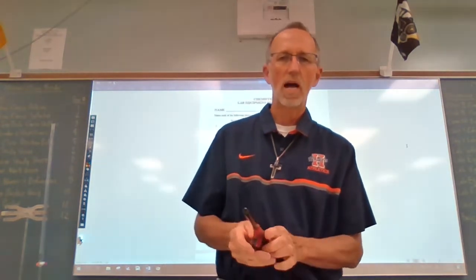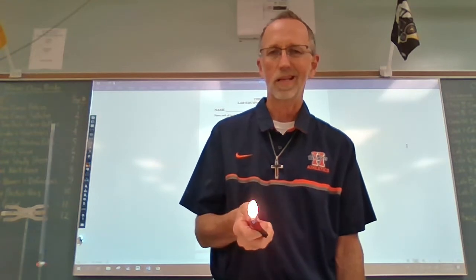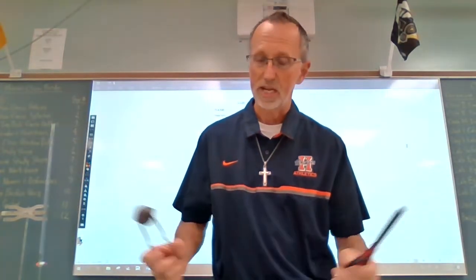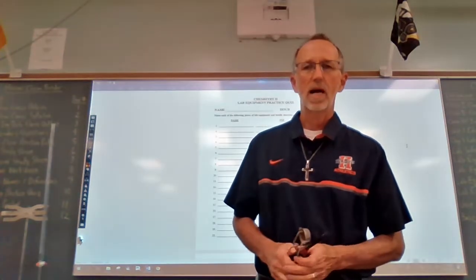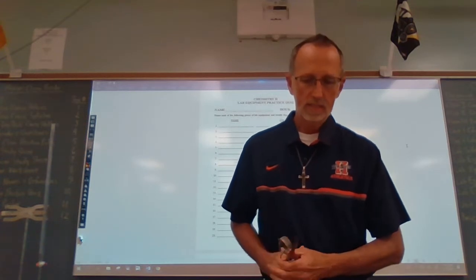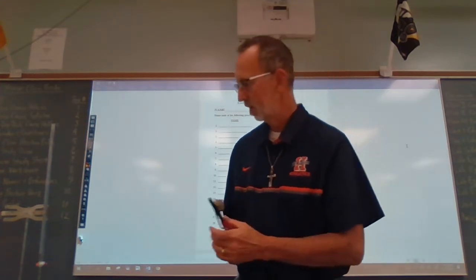So I've gotten these from Walmart or the dollar store or whatever. They're pretty reliable until they run out of butane, of course. But the purpose for a striker or this lighter is the same, and that is to ignite a flame. We use them to light a Bunsen burner.